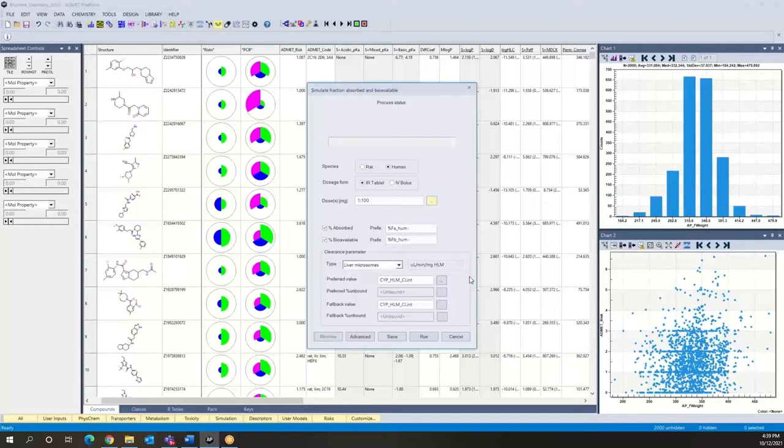One of the strong premises of this program is that it can proceed entirely from structure or use a combination of experimental data and simulation. Here in this first run, we're going to go entirely from structure using the default settings.